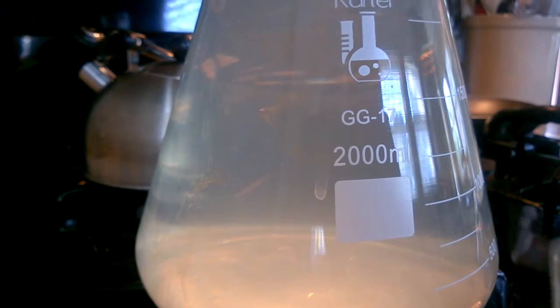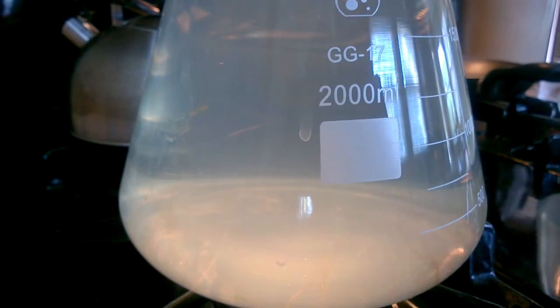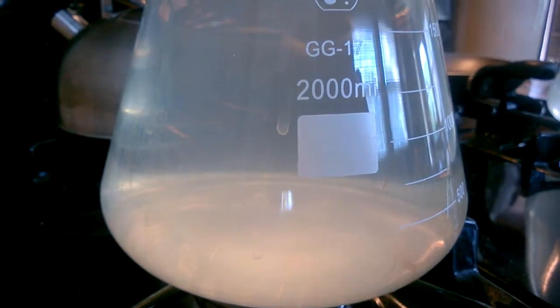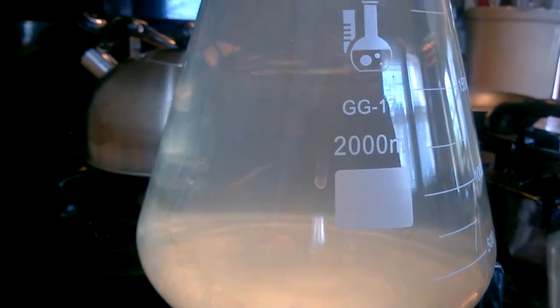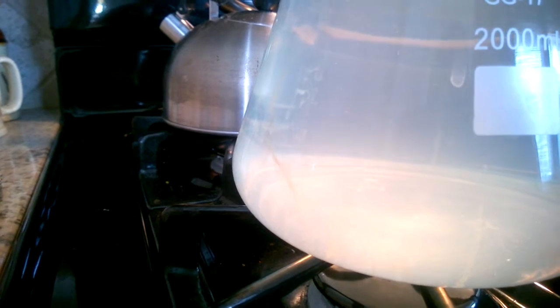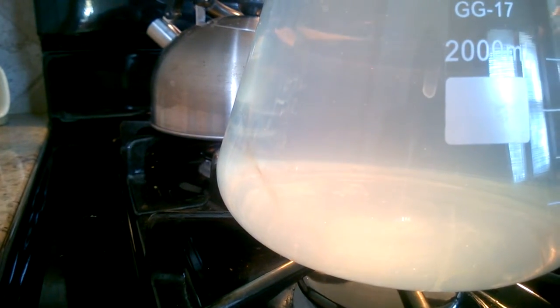What you see moving through the PBW there is all the crud that was in my Erlenmeyer flask that we use to make yeast starters. That stuff really does a nice job. It's heated up to 180 degrees.